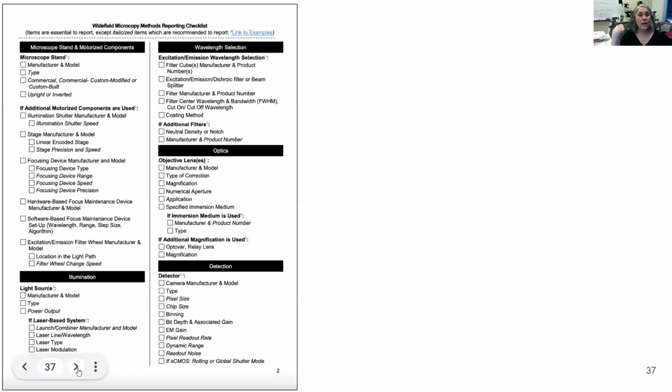Providing guidelines can be difficult since there are many parameters that are going to impact your imaging and the results. This is an example of one of them. We go through the light path. Anything that is in italics is good to have, but will perhaps not be impacting your data.